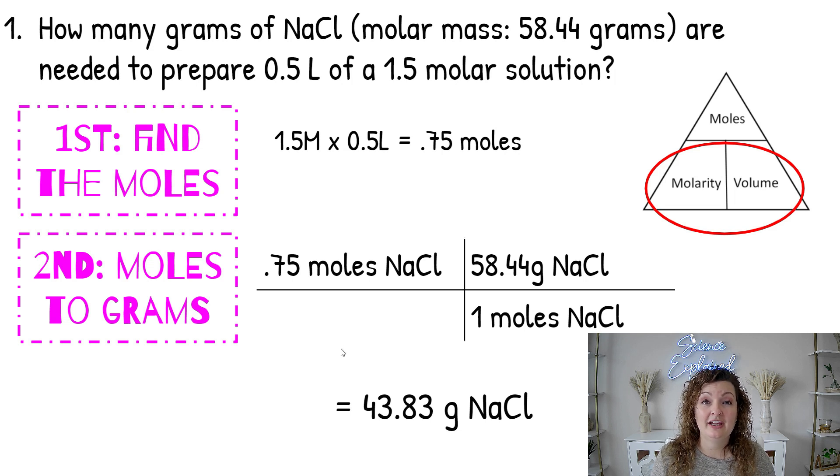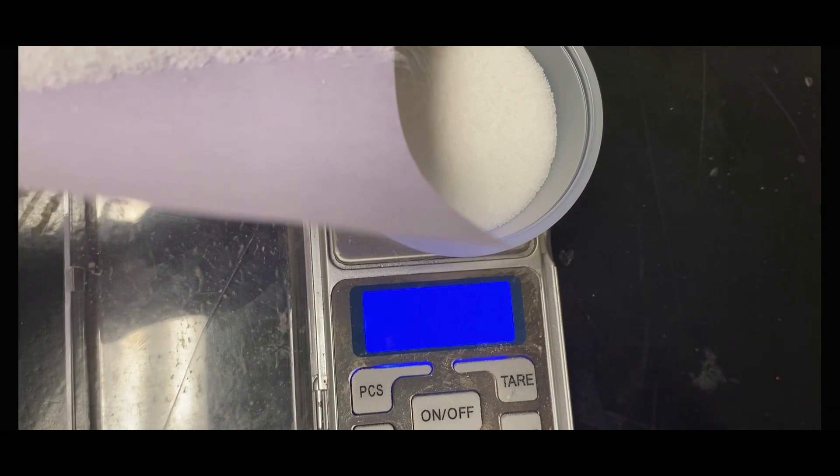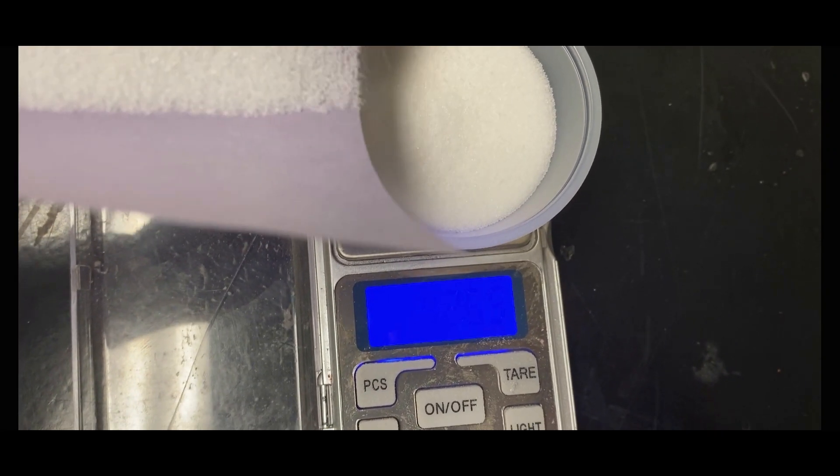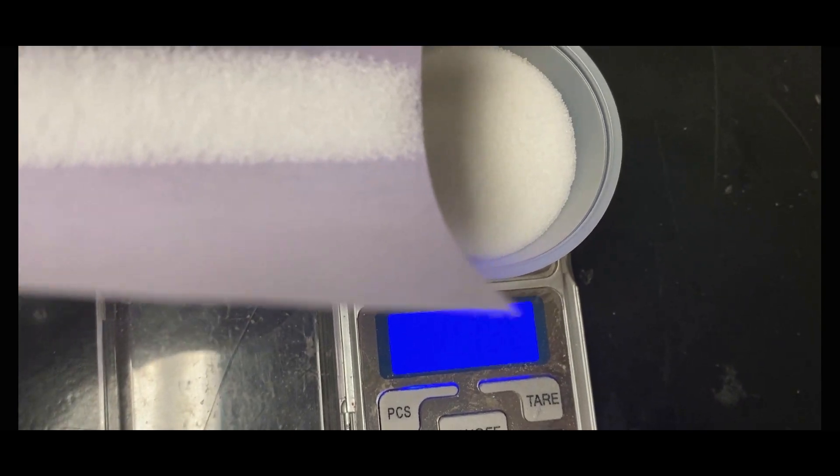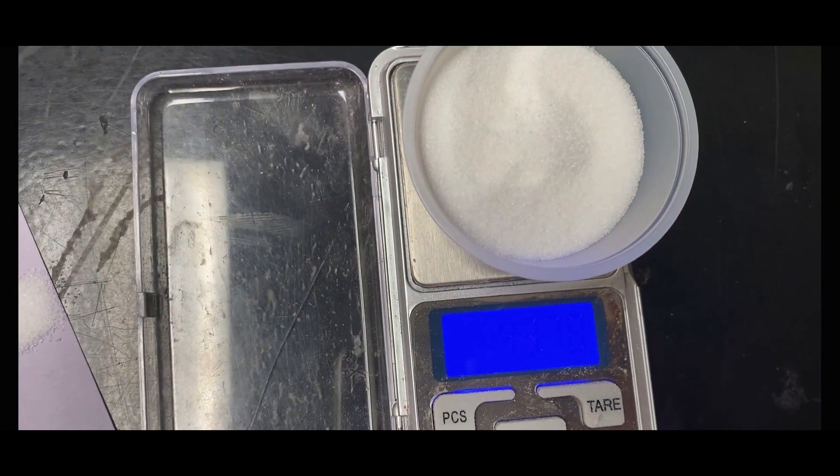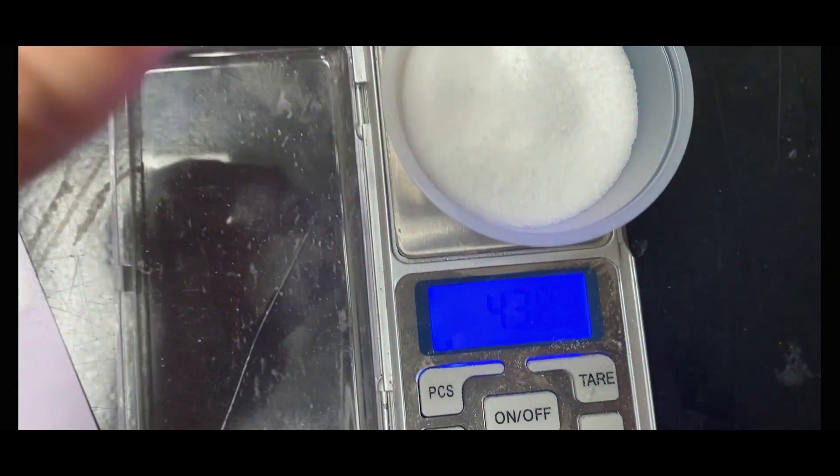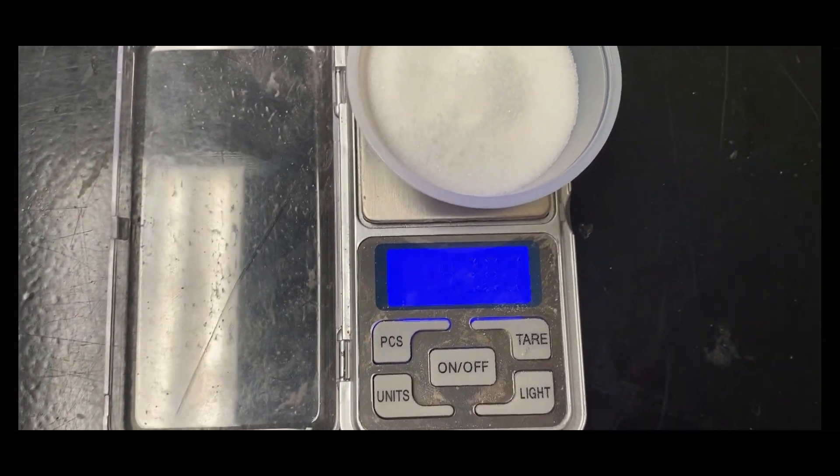Here's what this looks like in real life. Okay, so here we go, we're going to measure out that 43.83 grams of our NaCl, which is just sodium chloride or regular table salt, and you can see that I'm trying to make it as exact as possible. It's hard to see those numbers on the electronic scale, but it is exact.